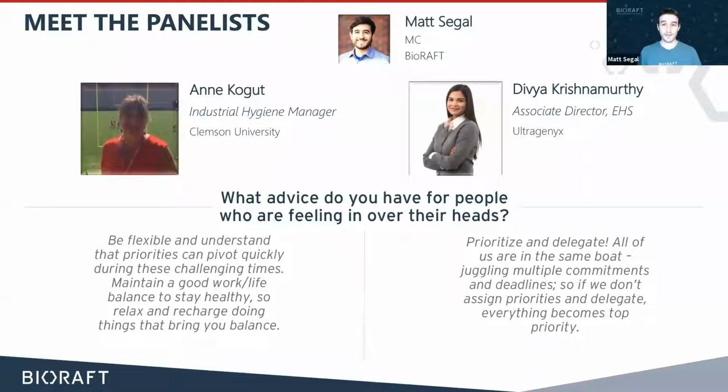Fantastic. It sounds like from both of your responses that the big benefit is that these are things pulling double duty or triple duty, right? On your side, being able to use your inventory to help inform first responders or guide your efforts in locating particular chemicals. And Divya, I'm curious, in addition to this work alone policy grid taking some burden off you, have you found that it has made some of your personnel more invested in their own safety and more aware of the risks they face in their day-to-day work?